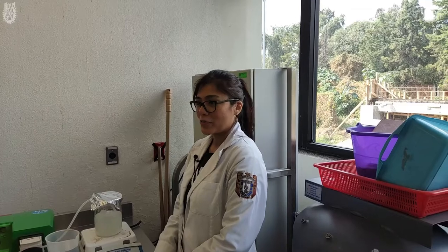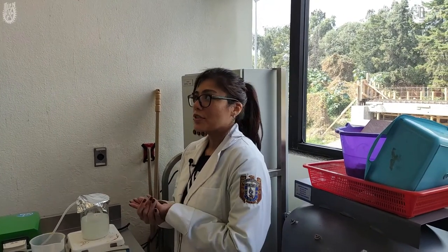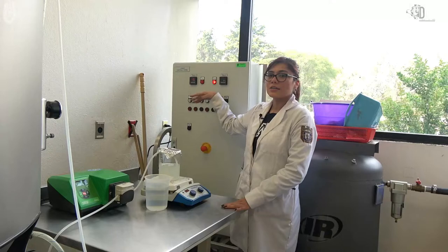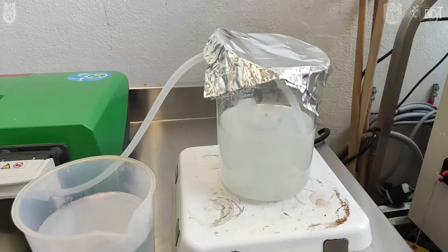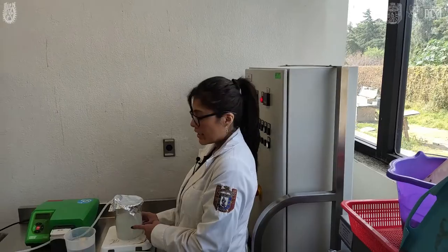Nosotros tenemos lo que es el secado por aspersión. En la industria alimentaria podemos encontrar lo que es la leche en polvo, y funciona en base a temperaturas altas, como 180 grados a 80. Aquí tenemos lo que es una dispersión, agua en polvo. En el caso de la industria alimentaria podemos encontrar lo que es la leche.